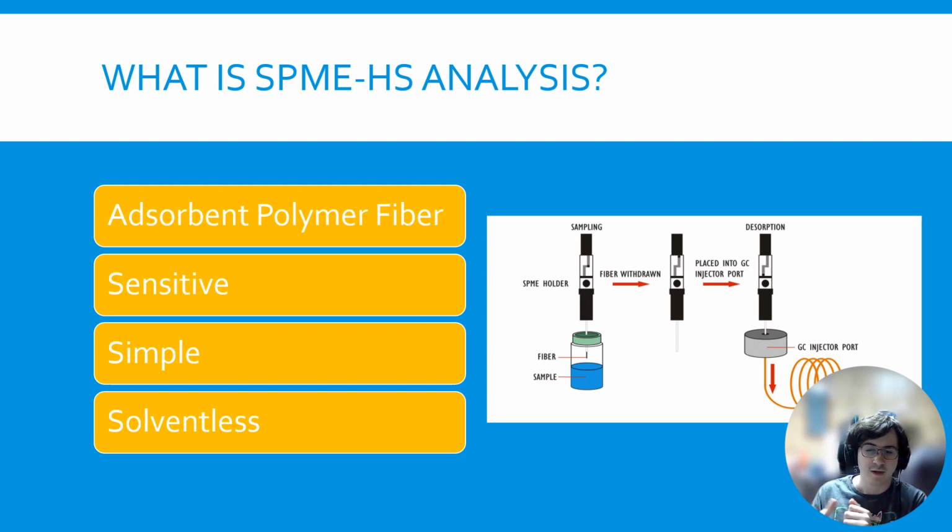Then it goes through the GC column to whatever detector it's been attached to, which in my case was usually a flame ionization detector. But for future students working with dog urine, it will more than likely be the mass spectrometer. That is more useful for determining actual masses, and the fragmentation patterns can be used to determine what molecules are actually being detected and in what relative concentrations.